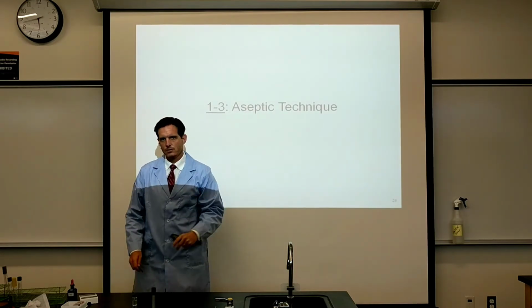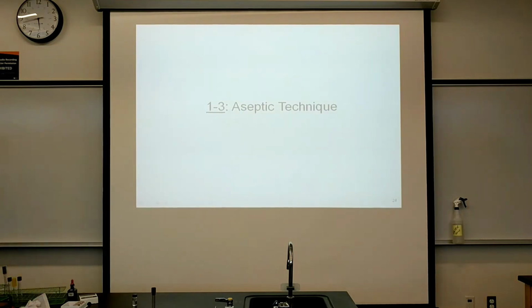So what does this word aseptic mean? Aseptic means without contamination. So we need to learn which techniques are effective at preventing contamination.